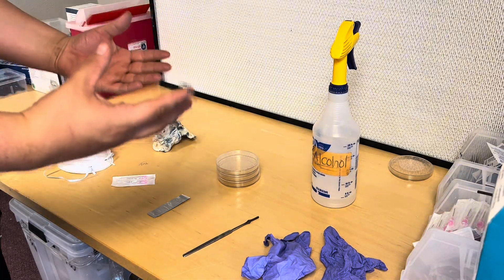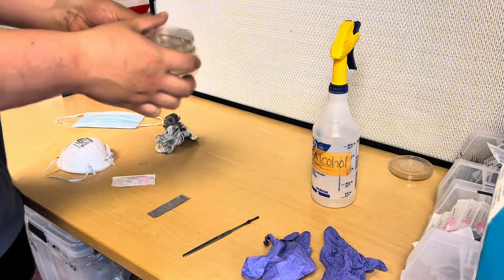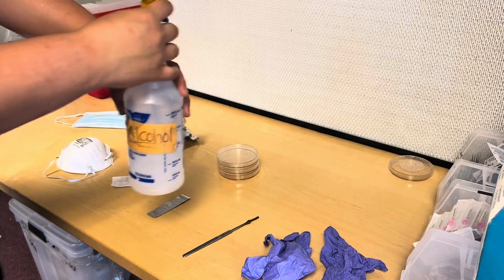Welcome back to the video. Today I'm going to show you guys how to take a clone of your mushroom onto agar. It's a pretty simple process. The things you're going to need: 70% isopropyl alcohol in a spray bottle. Make sure it's 70% because 91% dries out too fast.